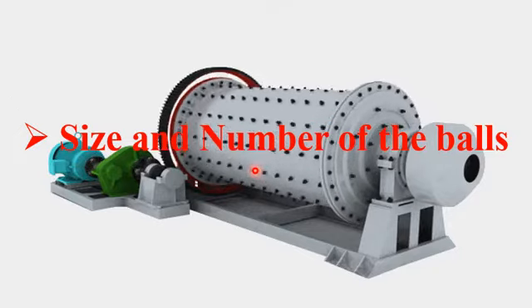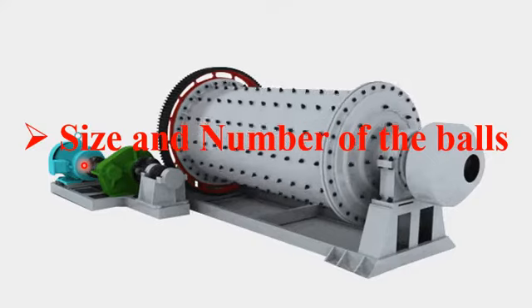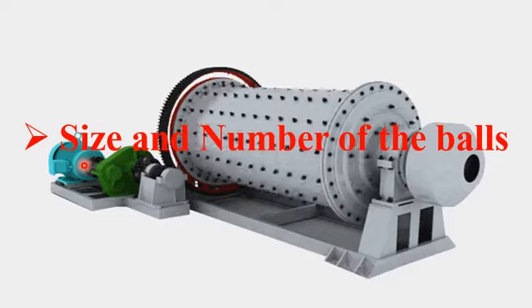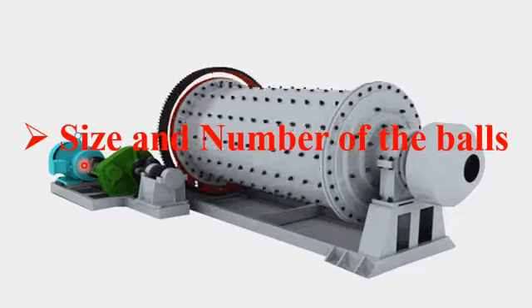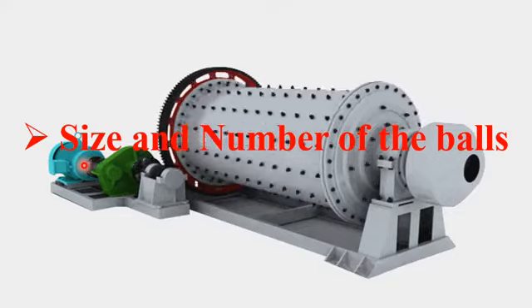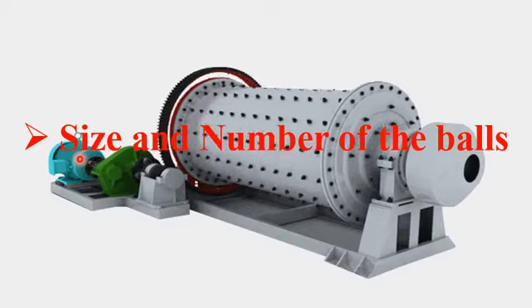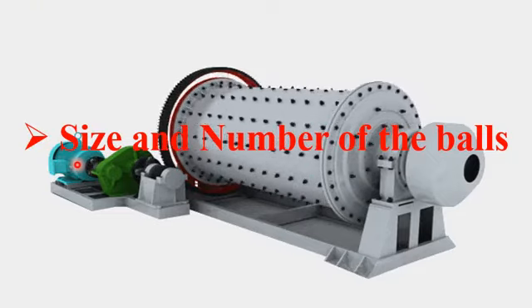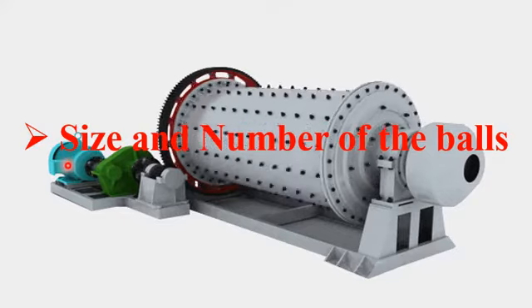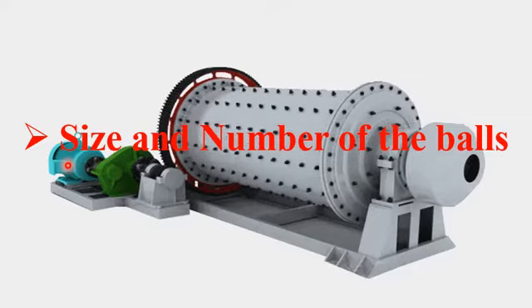And secondly, the bulk material which we want to convert into nanoparticles, if we use a larger ball, will usually wear inside the ball mill. So both the smaller balls as well as the larger balls in the ball mill process have pros and cons.